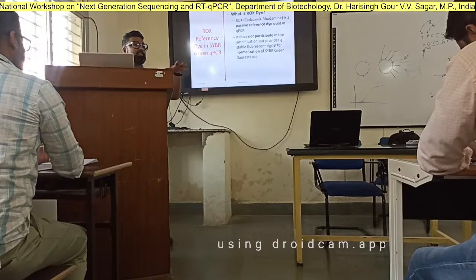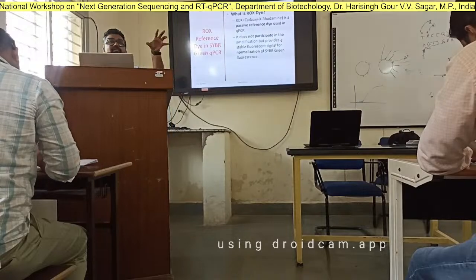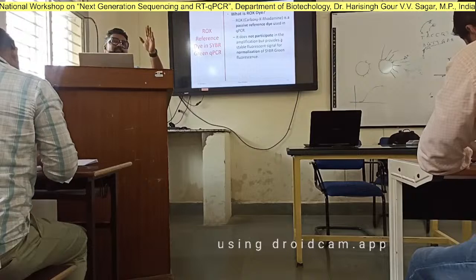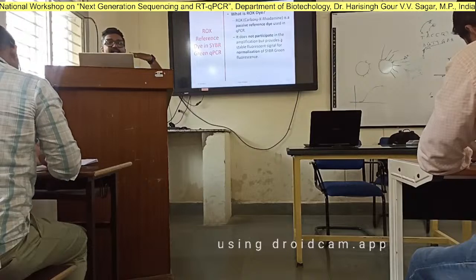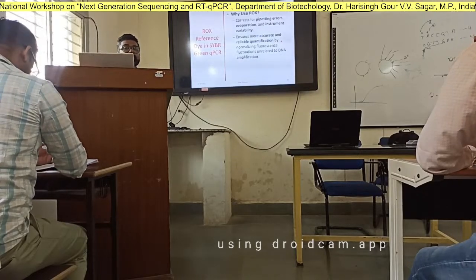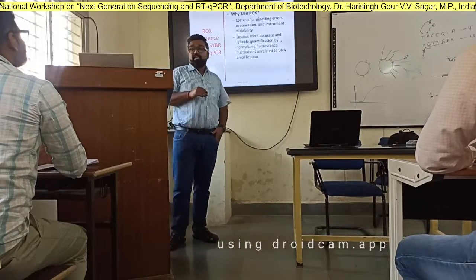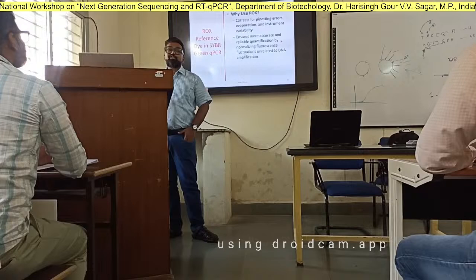This is something that is electronics and optics. Since we are getting multiple signals, and one signal is continuously increasing, you need to draw a baseline. What is my normal signal? What does ROX do? It corrects for pipetting errors, evaporation, and instrument variability.